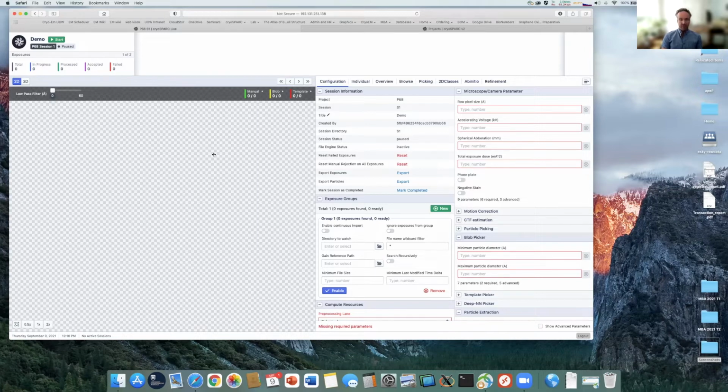This is actually quite an interesting machine that we built specifically for cryoSPARC Live. It's all SSD, so I've got about 16 terabytes of SSD, and a rather large NVMe cache set up on this box, as well as 6 GPUs. So basically all the processing happens on this box, while the movies are stored on a separate file server. What I'm going to do is set up all the different parameters for cryoSPARC now, and I'll run through it and you can watch.